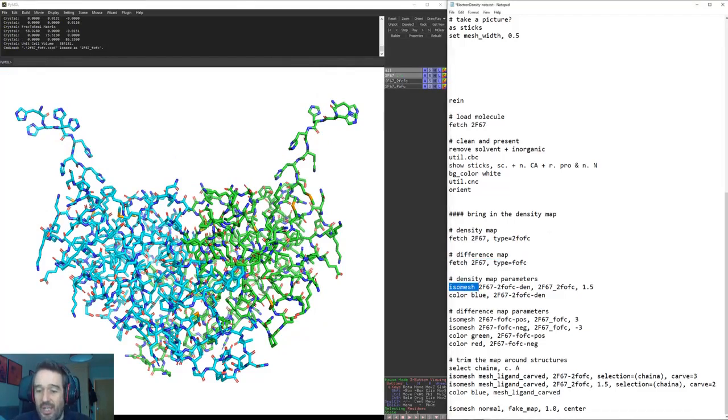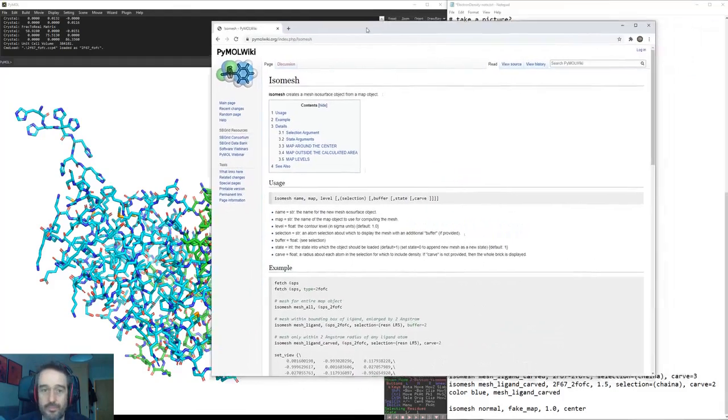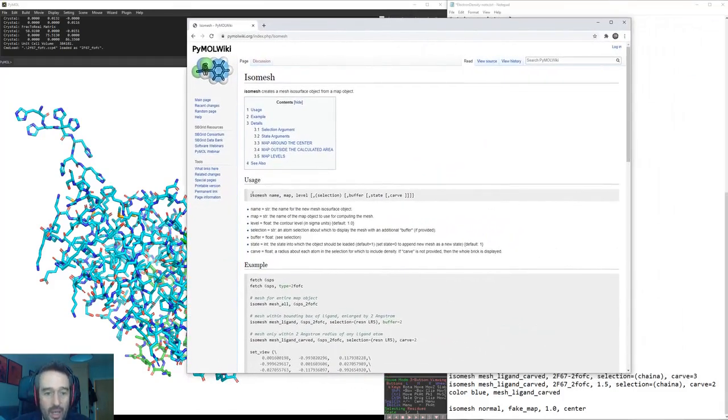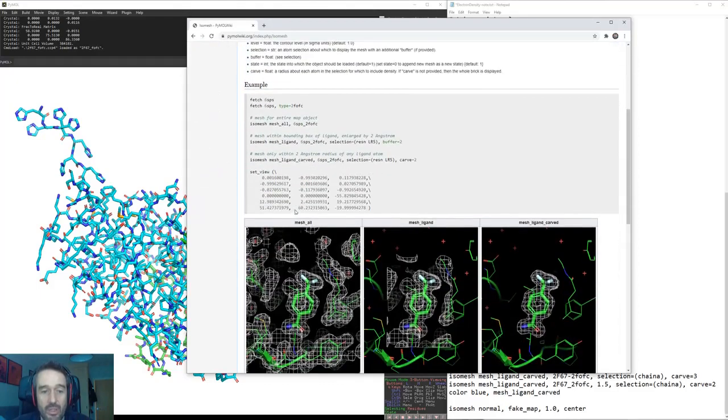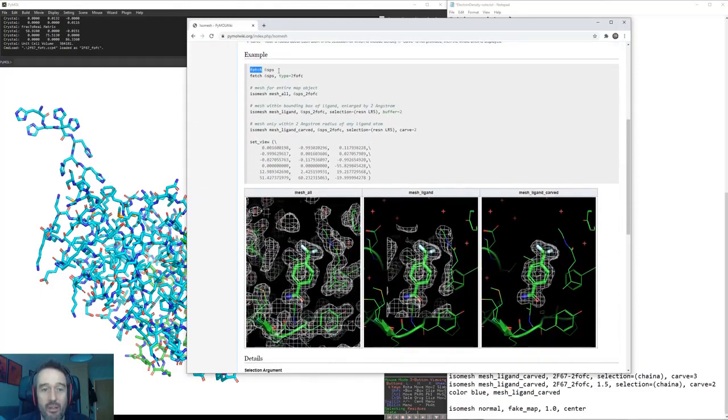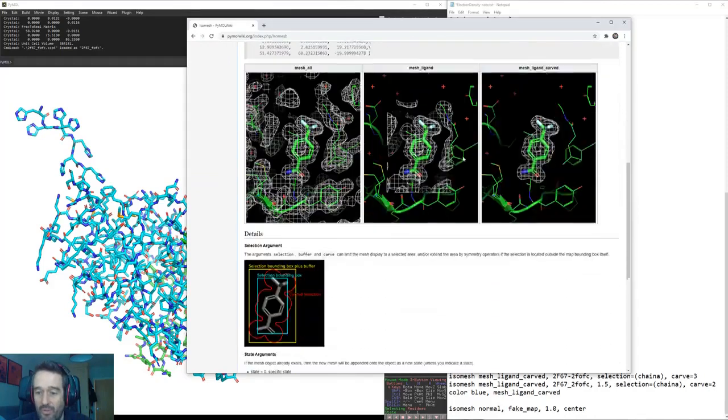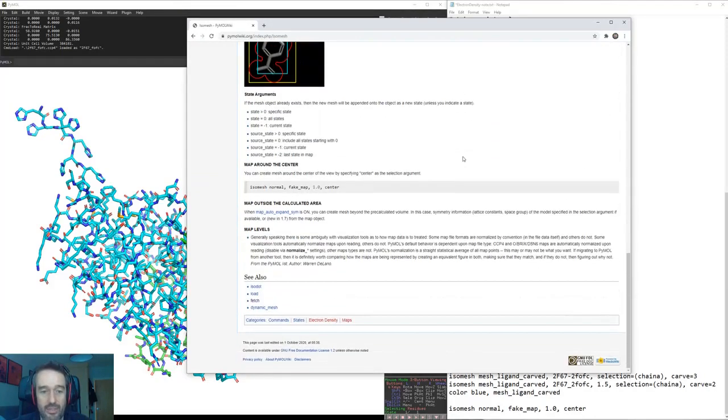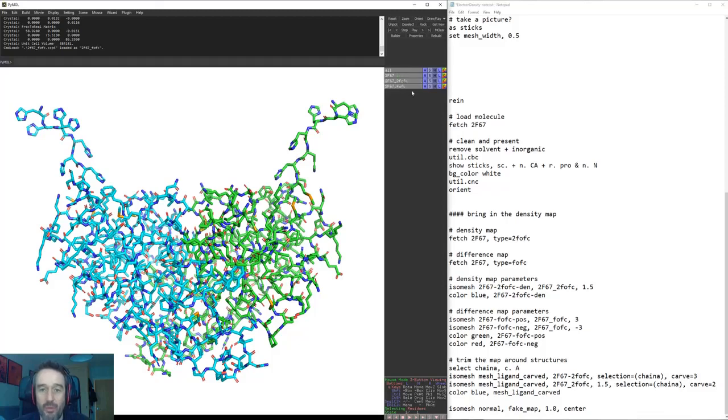Now what we're going to use is isomesh. Isomesh of course is one of our Pymol commands and we can view the isomesh commands in Google on the Pymol wiki. Such as here, and here we can see we'll just start off with our isomesh command: the name, the map, and the level. It gives some examples here of how to go about using that, always worth having a look at the wiki here for all the different commands.